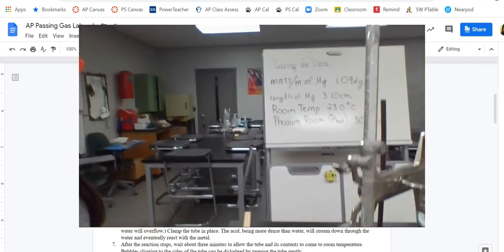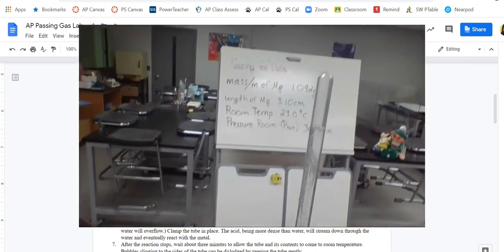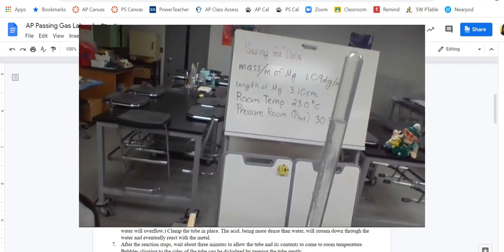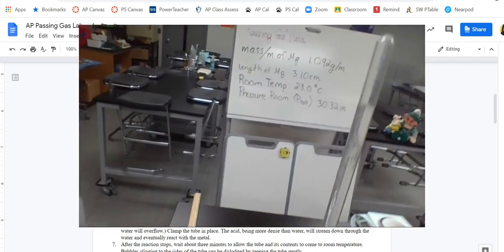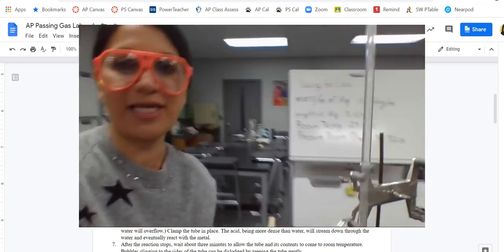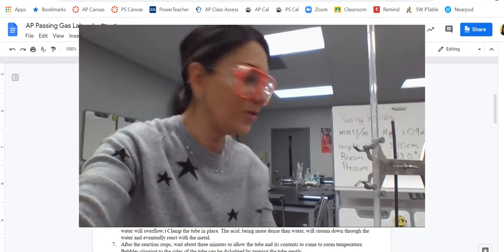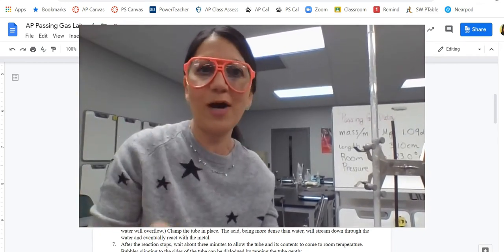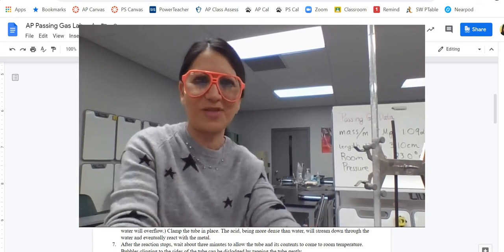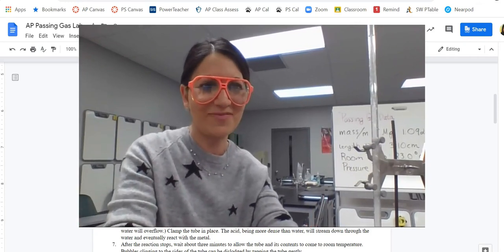Okay, let's take a look up at the top and see what's going on here. Oh, what? We've got more gas that's being filled here. Okay, so this is going to keep on going, and I will come right back as soon as it looks like all of the bubbles are done. Now, we say that the reaction doesn't necessarily come to a stop. The reaction eventually comes to equilibrium, okay? So we'll be right back.